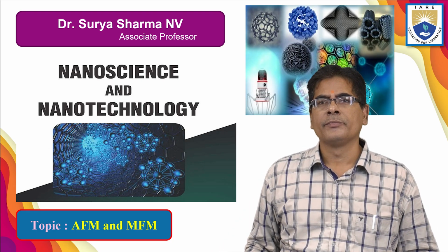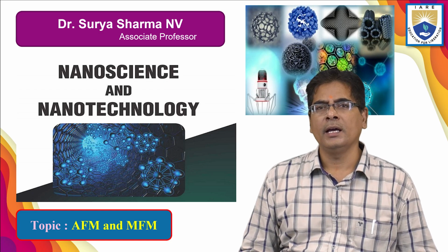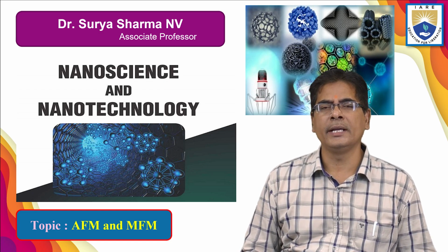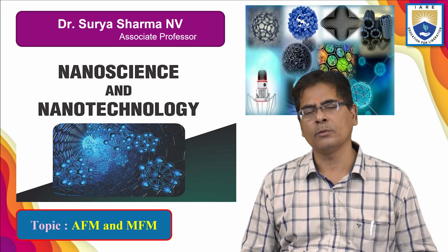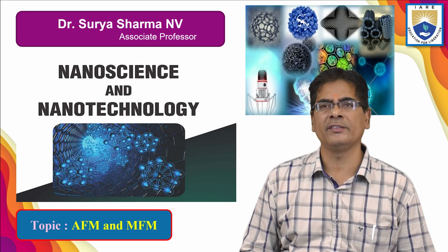In previous lectures, we have seen the differences between scanning electron microscopy and transmission electron microscopy, where these two types of microscopies have their own significant differences.